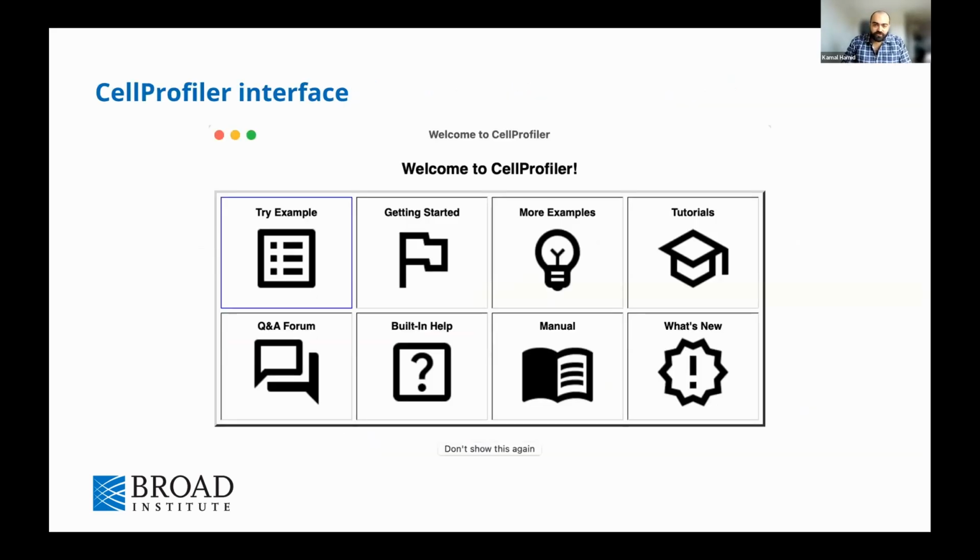So CellProfiler tries to combine all the good things of these different softwares and tries to produce a very user-friendly tool, with basically virtually no coding experience actually required, and it allows you to build these pipelines for image analysis in your experiments. Now, when you open CellProfiler, you will typically be welcomed with this sort of window, which is actually itself rather helpful.